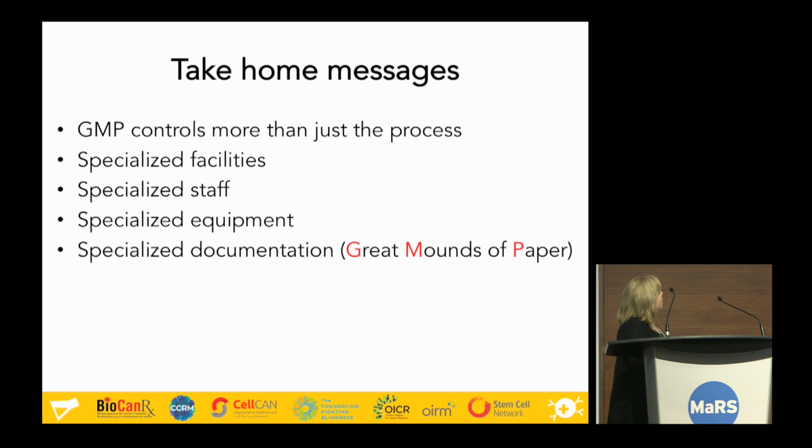Specialized equipment has to be used, and so the equipment, even though it looks the same, we have incubators, but our incubators are mapped on every plane in the incubator to say that the temperature in the back corner is the same as the front. We monitor it 24/7. We get alarm messages on our phones if it goes outside of that temperature. Maintenance is recorded daily, weekly, monthly. It's all about making sure that it's going to do the same thing today as tomorrow as next year.